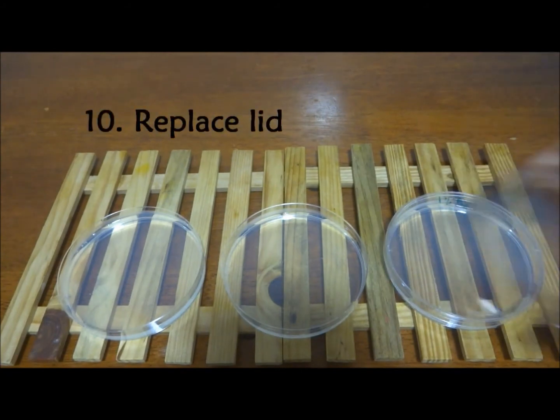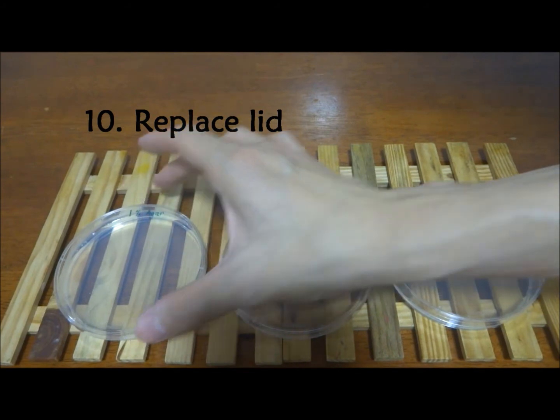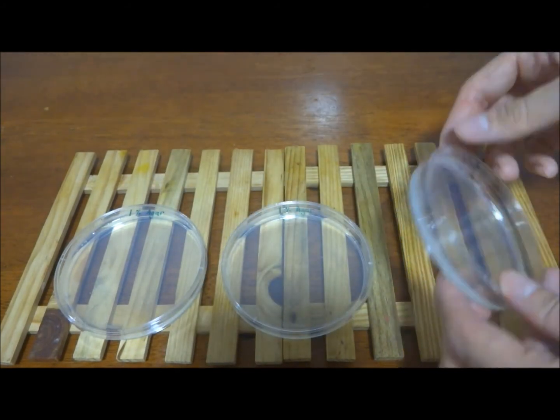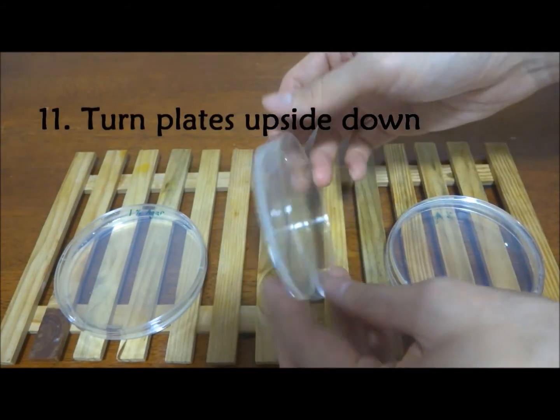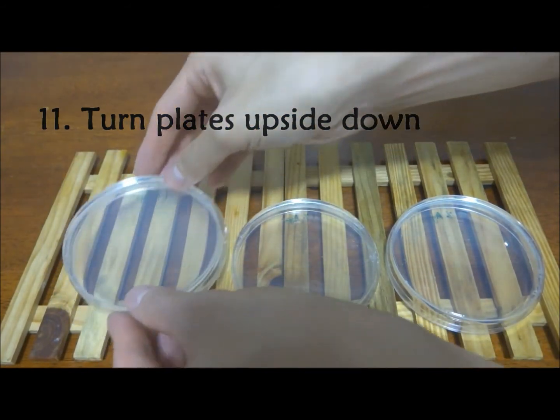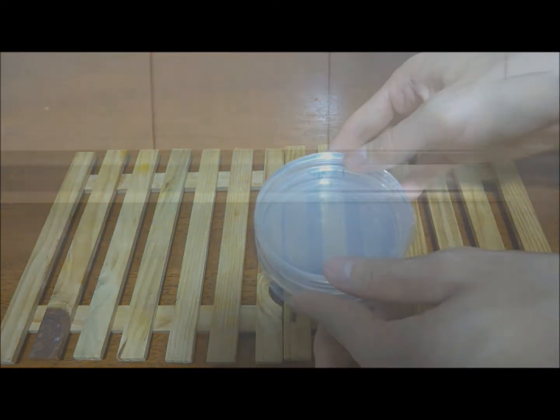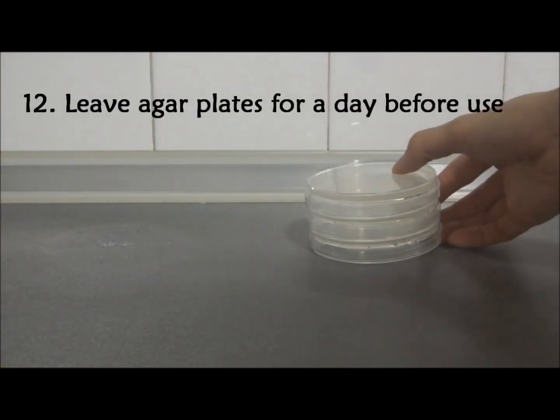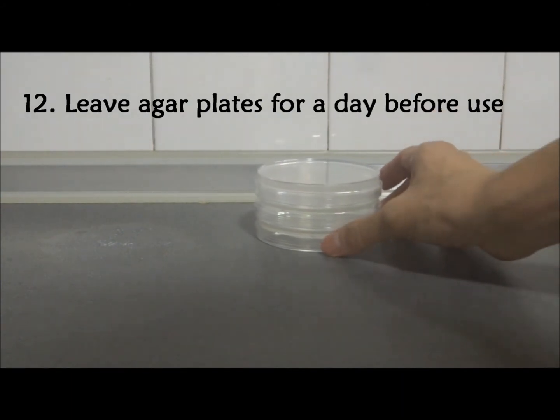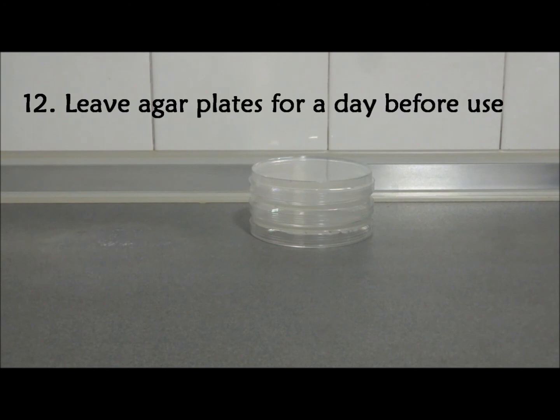After the agar has solidified, replace the lid and turn the plate upside down. Store the agar plates upside down in a clean and cool area for a day. After allowing a day for excess moisture to evaporate, the agar plates can be used for your experiments.